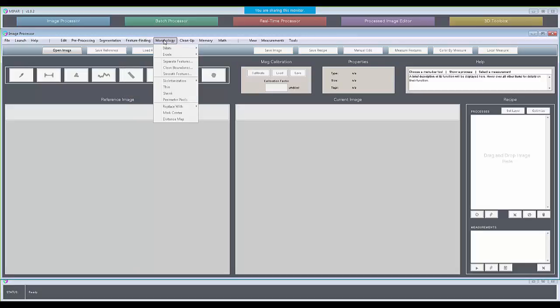Morphology are your first manipulation steps of your rough feature detection, eroding and dilating, separating features, smoothing them, making skeletons, replacing objects with equivalent shapes. In your cleanup menu, you have our beloved reject features tool that is quite commonly used in any recipe, and it lets you select or reject features from your selection based on their being above or below any number of different parameters.